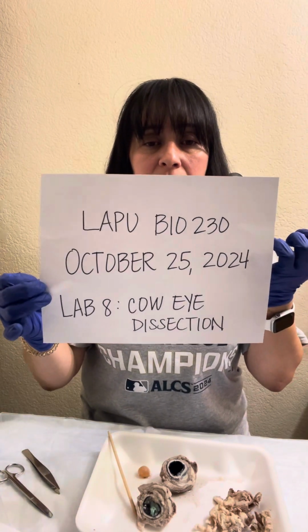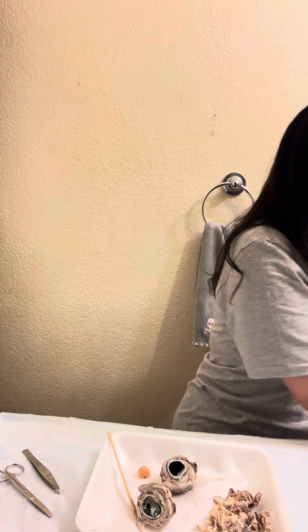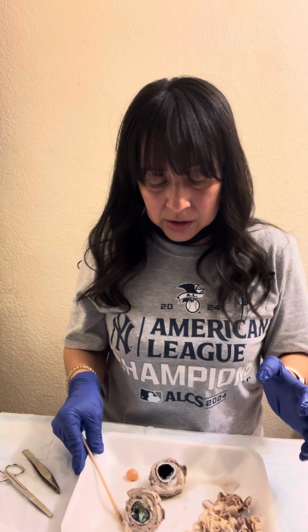My name's Amber Fox, and this is my cow's eye dissection. So here is my cow's eye. I already separated the anterior and the posterior cavities.